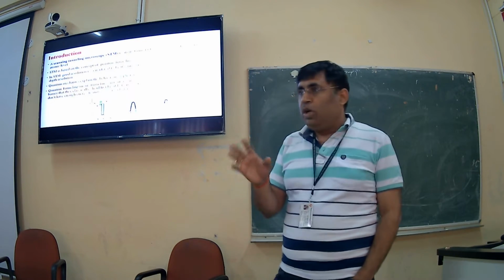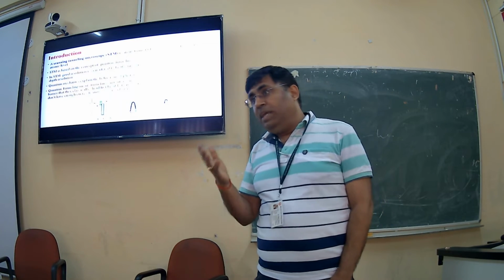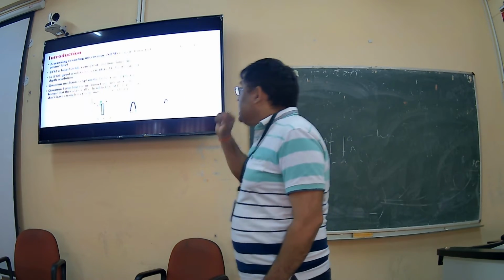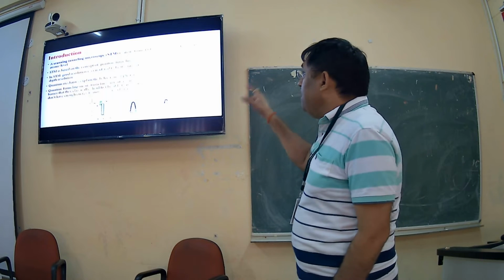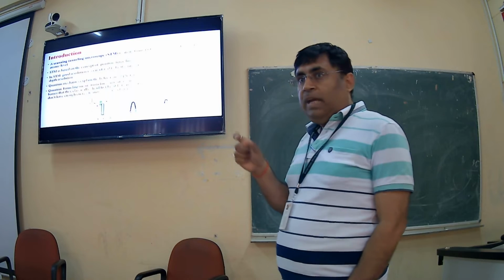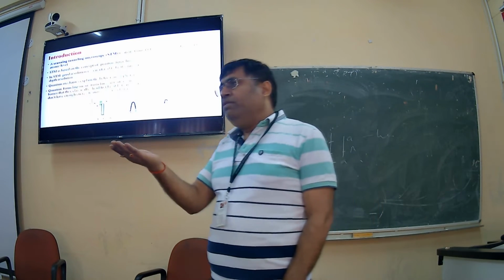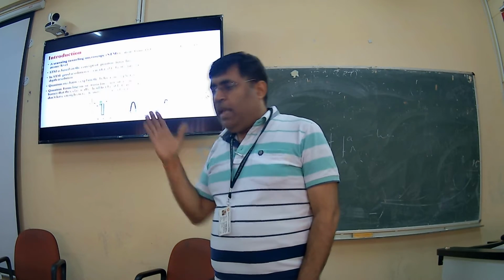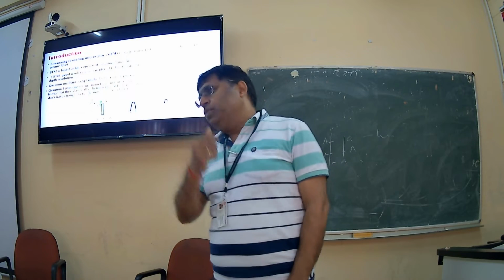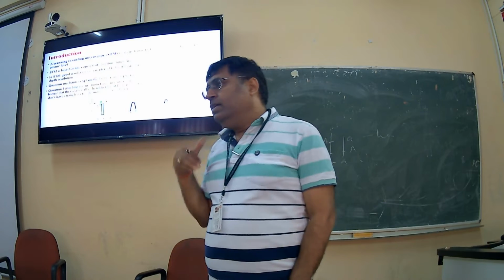It's not that you are talking about micrometer or millimeter. No, it's much smaller. It's atomic level. STM is based on the concept of quantum tunneling. That's why it is called tunnel current. I told you that a hill you can cross by going up and down, or you can make a tunnel and easily cross. So because the electron has a dual nature, it can tunnel.